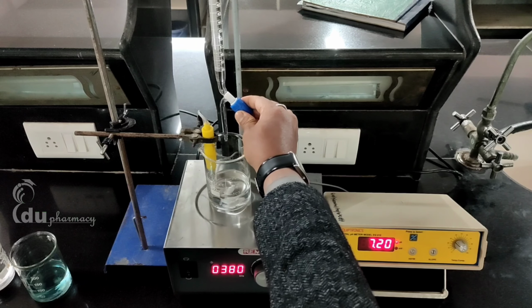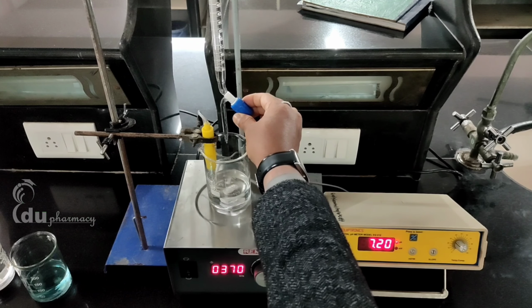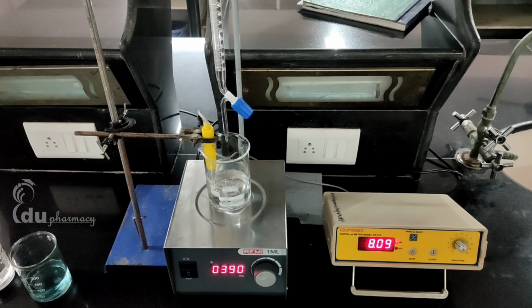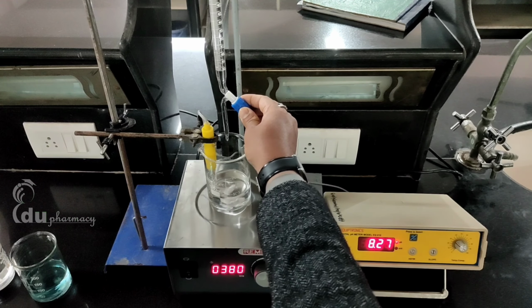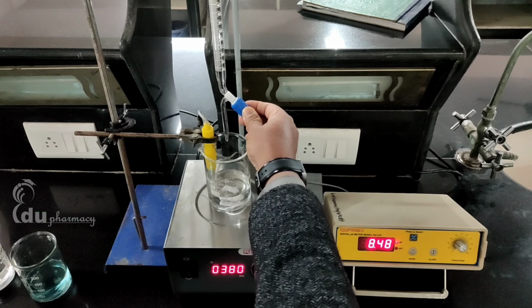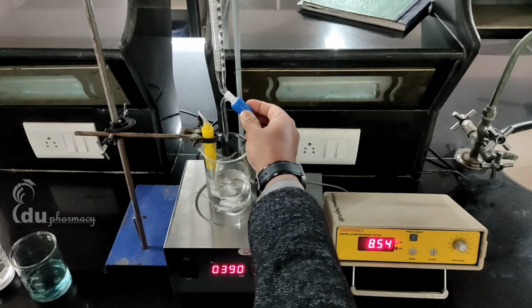Now I am going to add 1 milliliter of sodium hydroxide to glycine and then observe the pH. I will continuously add sodium hydroxide solution with a 1 milliliter increment every time, and I will note the pH reading on the pH meter. We must take at least 10 readings to get the titration curve and note the observations for the calculation part.